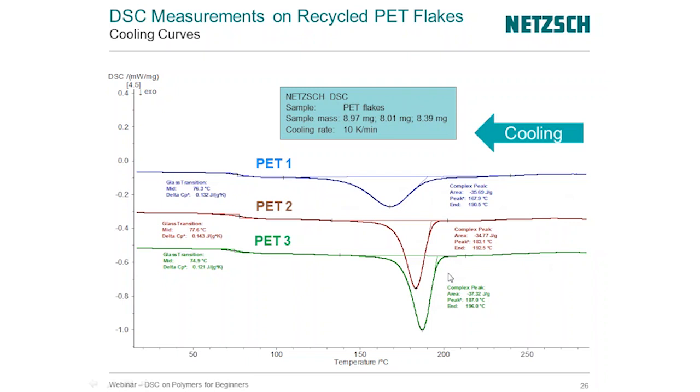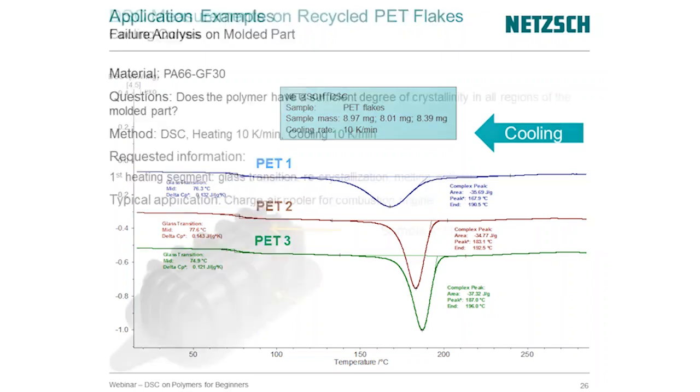And so that indicates to us as well that there's definitely something going on that's causing this material to nucleate earlier and possibly start this curing process, or the recrystallization process, earlier. So again, there's probably some kind of contamination in these materials, at least from what we can see comparing 1, 2, and 3. Definitely there's something going on in 2 and 3. And even those two are different from each other as well, 2 and 3.